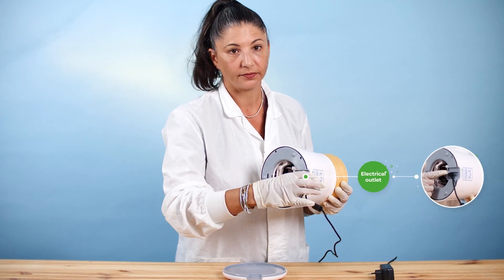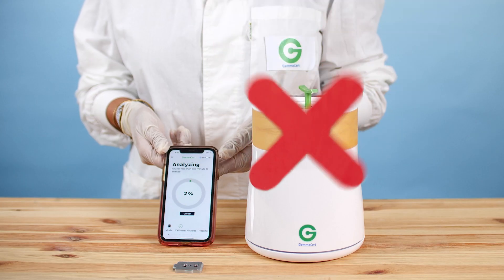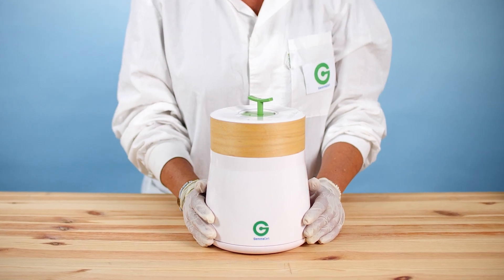Connect your GC to the power supply and pair it to your Android or iOS device. Do not analyze oils or otherwise diluted products. These will spill and destroy the device.